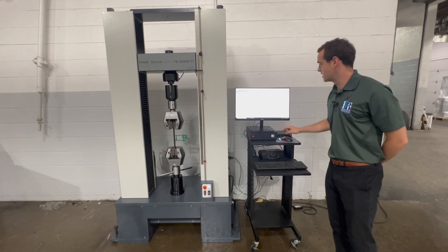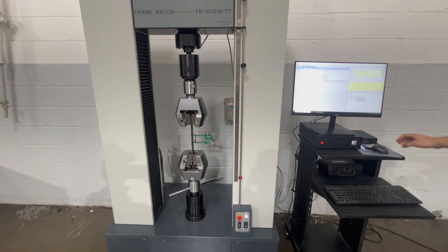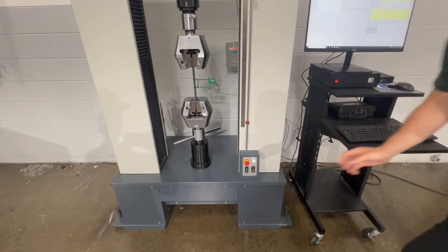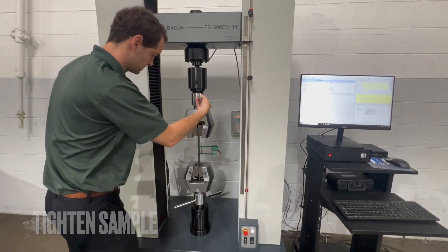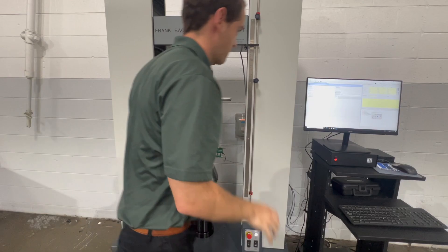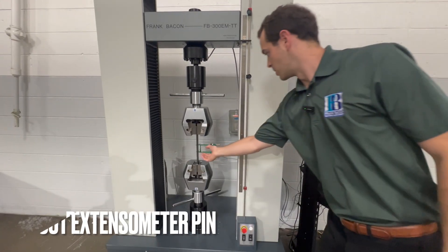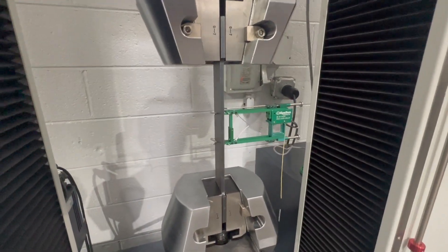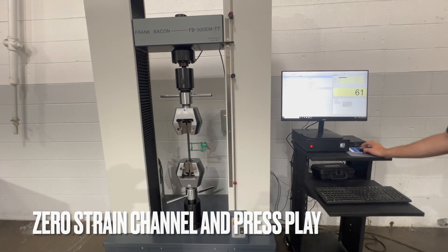We have a profile set up in our MTGenius software. We've got an extensometer on our sample and we're going to do a stress-strain graph. I'm going to go ahead and turn our machine on, tighten in our sample, pull out the pin on our extensometer, zero out our strain channel, and press play.